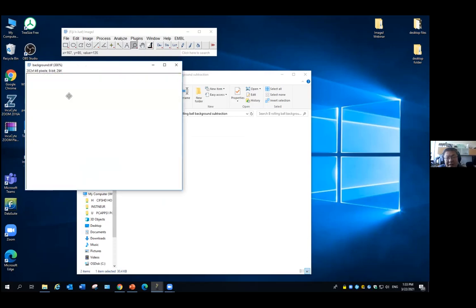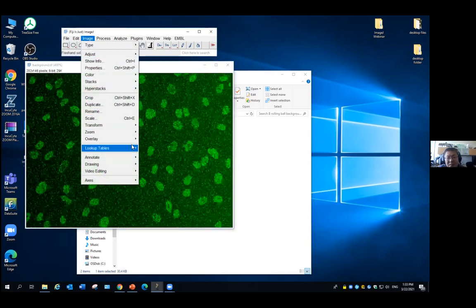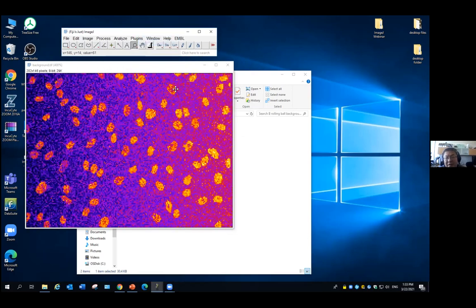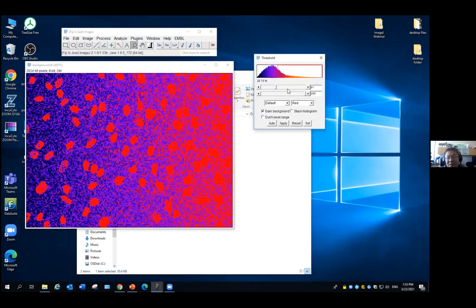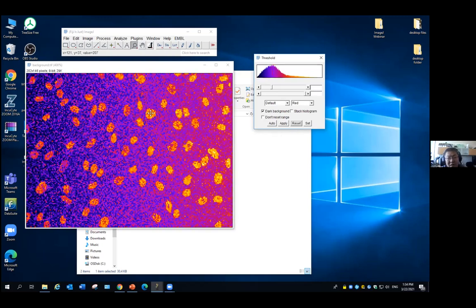So this is basically the same one we used for the previous result, but it's not only noisy, but also the right side is much stronger than the left side. So if you directly use thresholding, once you set a good cell mask on the right side, then on the left side we basically lose the cells. If you have a good cell selection on the left side, then the right side is all mask. Okay?